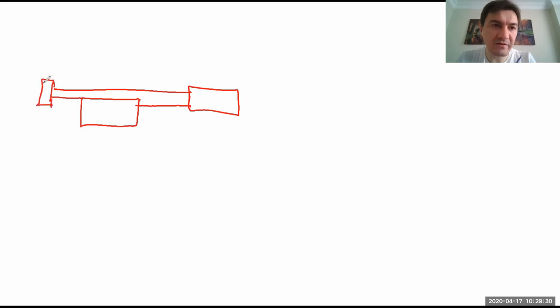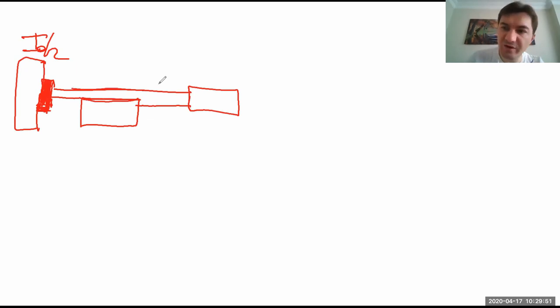Detector is staying in proper position. Okay, sample is staying in proper position. We see half intensity at the detector and the sample surface and X-ray beam are parallel to each other. So we are at perfect condition. But there may still be a misalignment between the surface of the sample and X-ray beam.